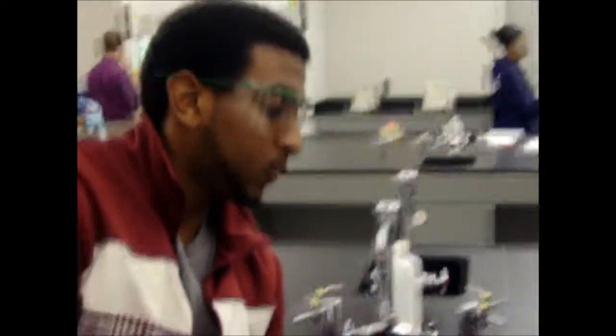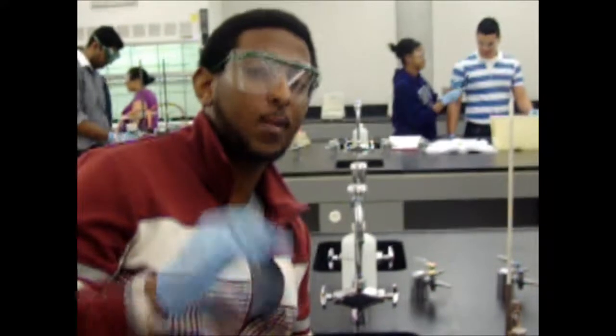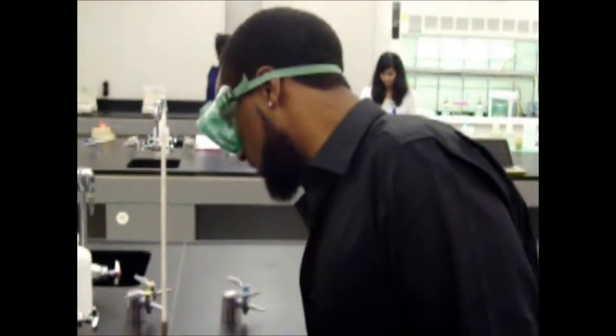Just a moment, let me see if I can get that. See how that white shape is still there? We want that to be clear, and then that's when we can say that it is now a liquid. So until that happens, we still have not reached the melting point. And one thing to note, once the granules melt, make sure to know when it started to melt, and when it became complete liquid, so you can get the range. Right now it's still solid, so we're still waiting. So I'm going to increase these temperatures very slightly.